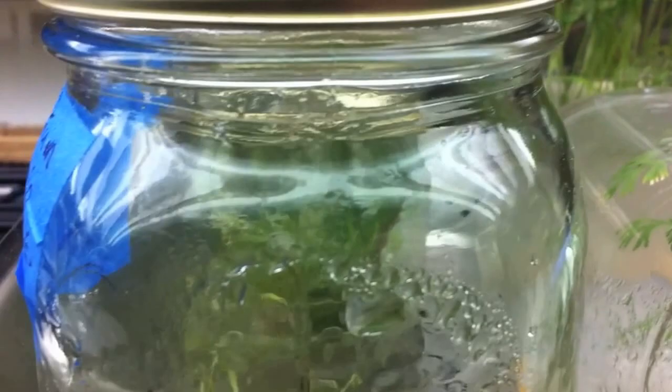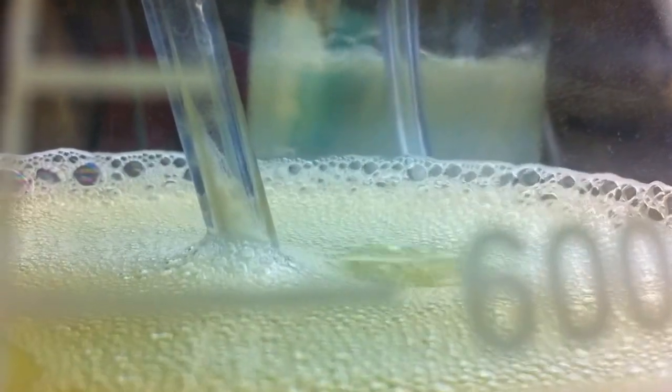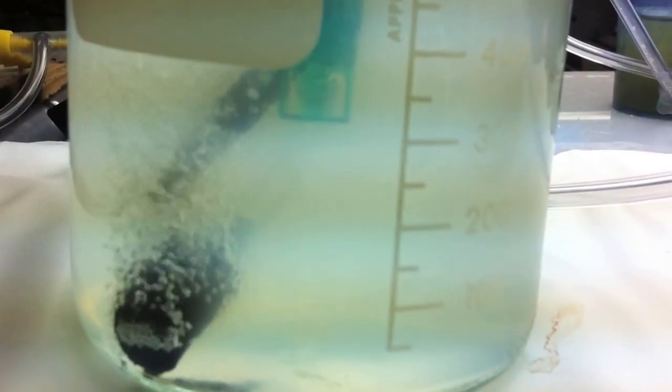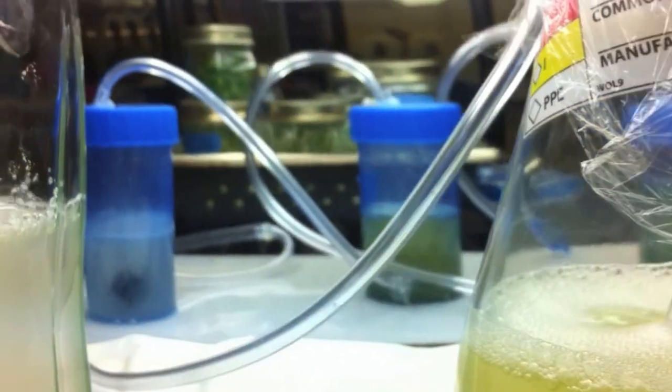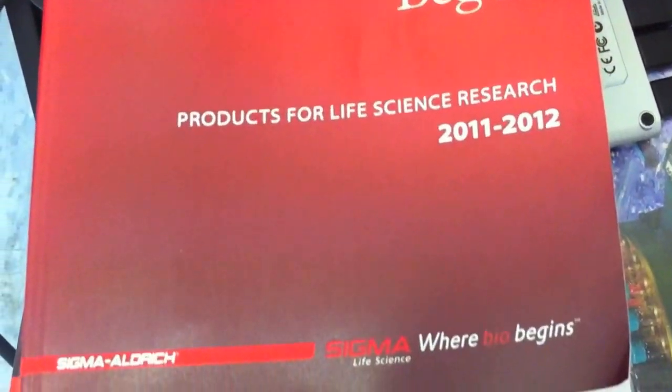Also available: microscope slides, multi-well trays, vortexers, ultrasonic baths, gel electrophoresis, gel dryers, CO2 incubator, water bath shaker, deionized water, ultra-pure water, stirrer plates, member storage — dry, negative 20 degree, and fridge — a mail delivery address with staff for your bio and chemical orders, and a supportive, knowledgeable community.